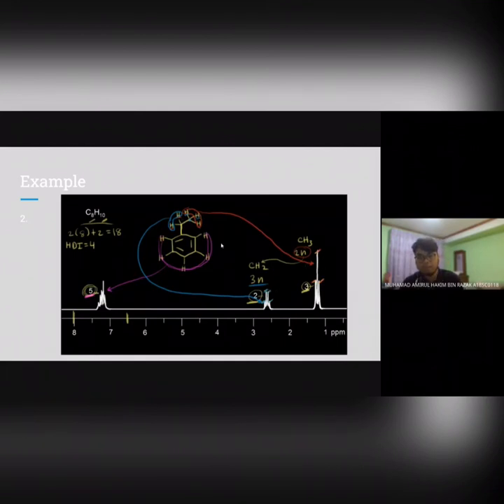Okay, lepas tu warna biru CH2 ada 3 neighbor. So 3 neighbor di mana? 1, 2, 3 sebelah kanan. Dia tak ada belah kiri ni, tak ada sebab yang ni still carbon. Tapi dia dah cukup semua 4 bond. So tak boleh letak H lagi. So tak ada. So betul lah kita punya susunan ni. Dan yang terakhir tadilah ni yang aromatic tadi.